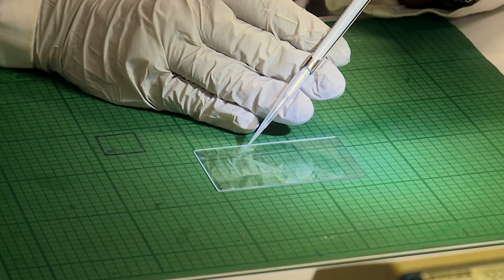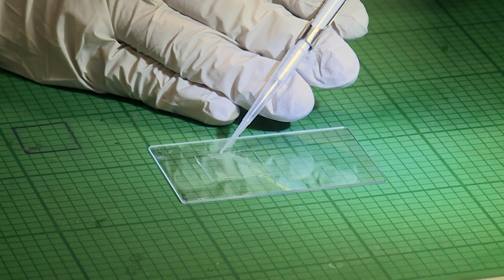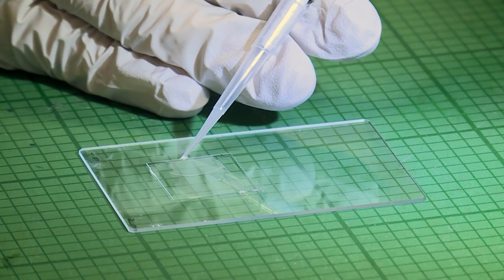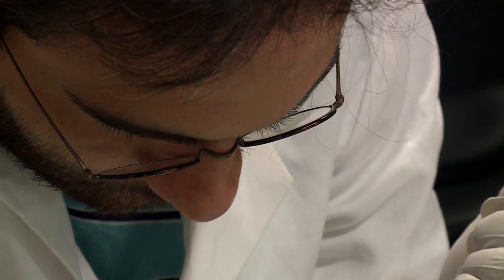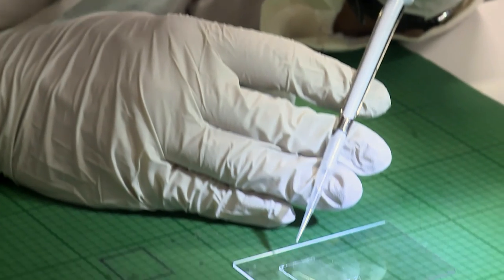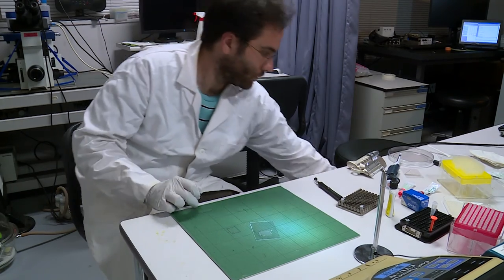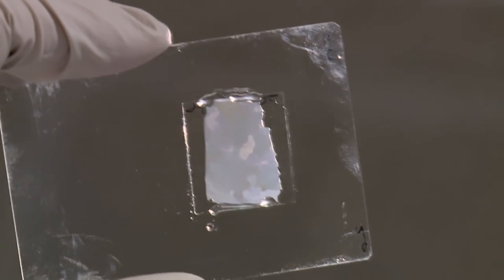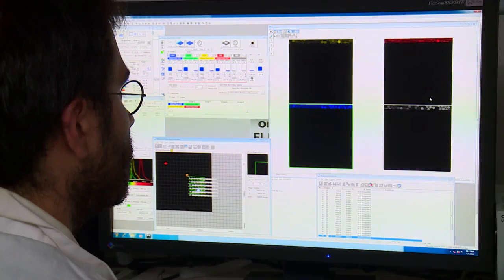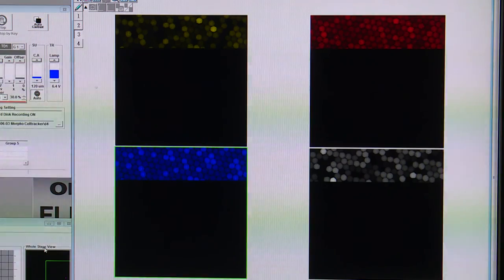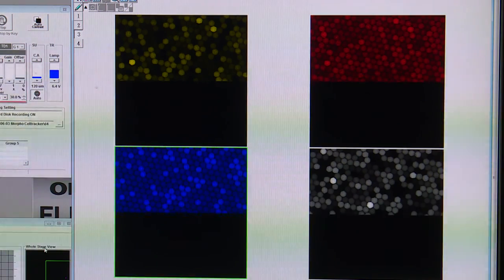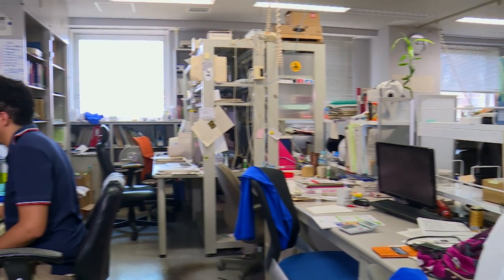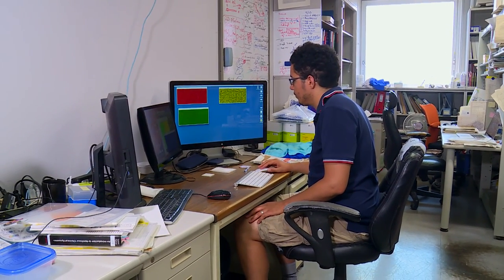The droplets are then compressed between two thin layers of glass. The system of DNA and enzymes continues to evolve. The researchers can now follow the progress of each droplet in real time by fluorescence microscopy. To achieve this, they had to develop cutting-edge mathematical tools.